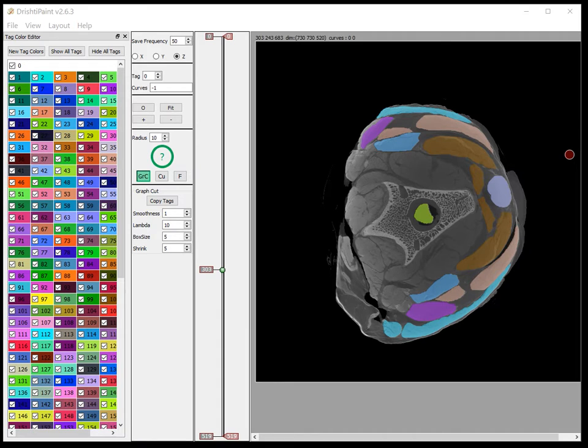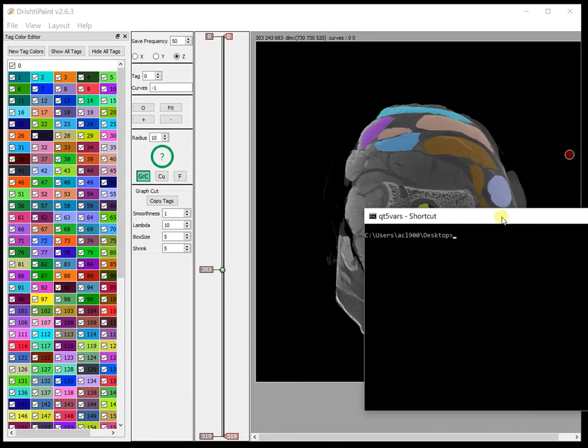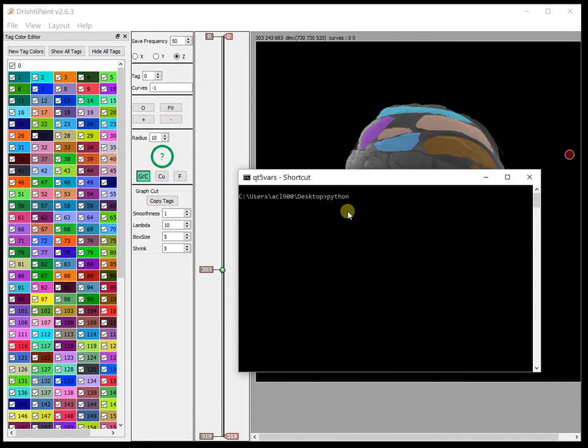So in order to do that, let's calculate the scale factor. We have only 255 values. If we shrink it by a factor of 0.5, then we have 127. So we can shift the tomogram to 128 and then further 127 values, but our top mask value is 145. So we have to put the tomogram beyond 150 or 160.